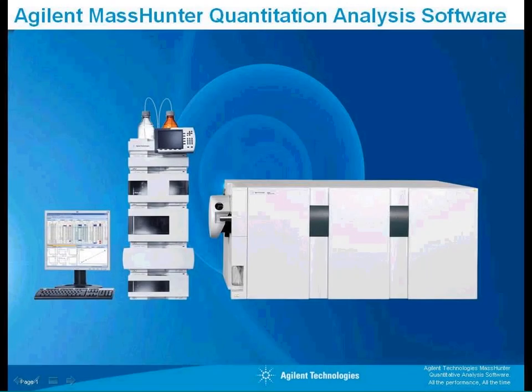Introduce the feature relative ISTD. Now, when using isotopically labeled compounds, this is sometimes called true ISTD. And sometimes, in a word that I will avoid, this is called semiquant. So, normally the term ISTD means ISTD correction. But here, with relative ISTD, we're meaning that the isotopically labeled ISTDs are used as a calibration reference internally.